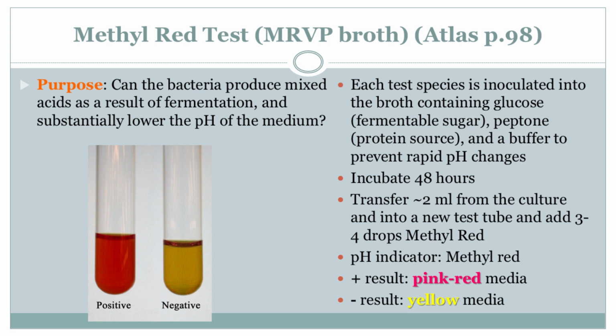Right. And don't forget about research. The methyl red test is a really important tool for microbiologists all over the place. It helps them learn more about how bacteria work and how they affect, well, pretty much everything. It just goes to show that the tiniest things can have a huge impact. We've learned so much just by looking at a color change in a test tube. Absolutely. And it makes you realize there's always more to learn.